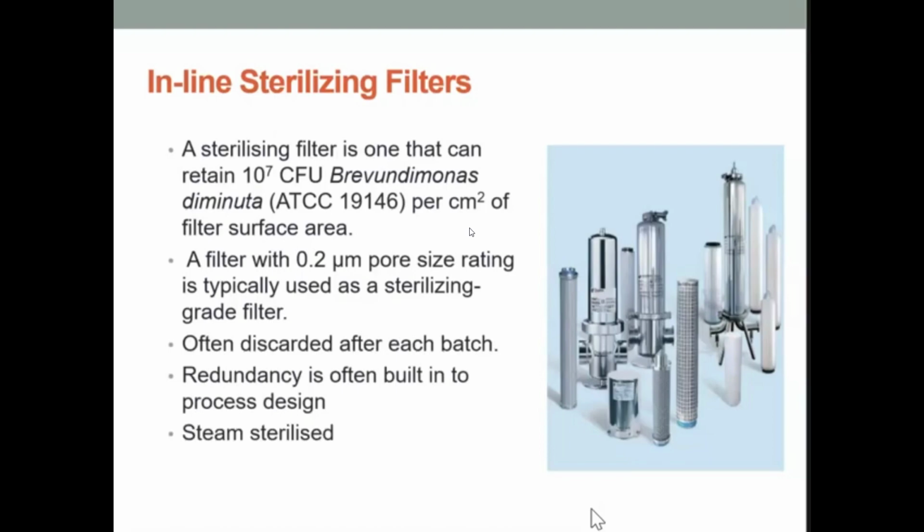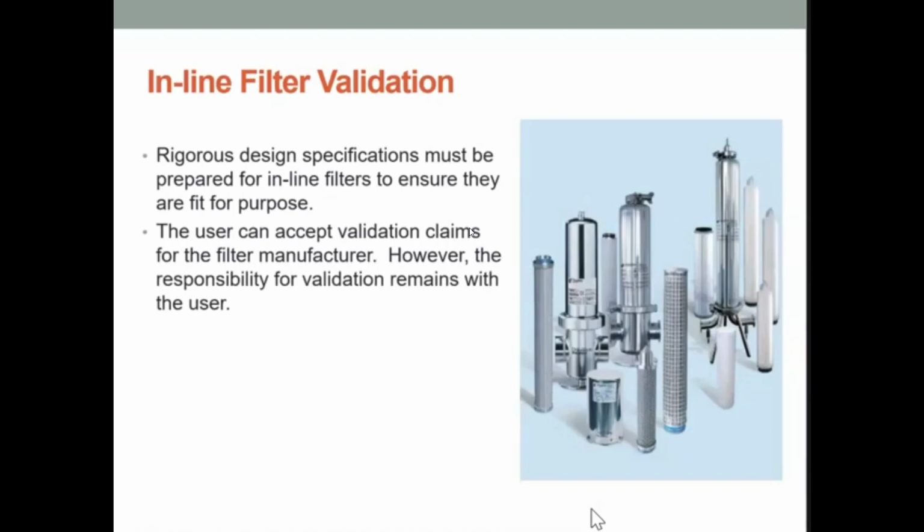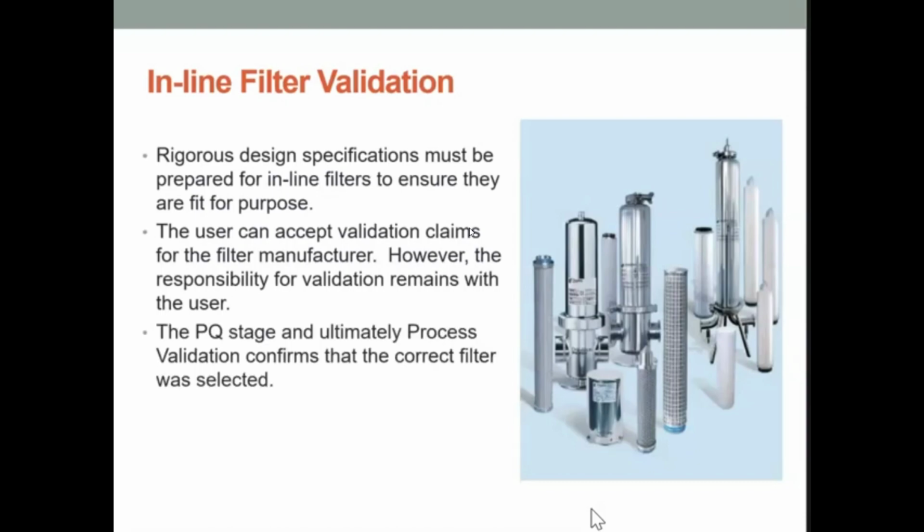They are steam sterilized. Rigorous design specifications must be prepared for inline filters to ensure that they are fit for purpose. The user can accept validation claims from the filter manufacturer. However, the responsibility for validation remains with the user regardless. The PQ stage and ultimately process validation confirms that the correct filter was selected.